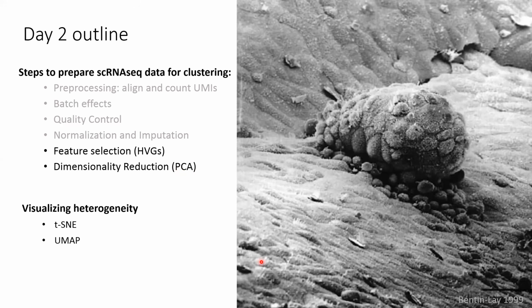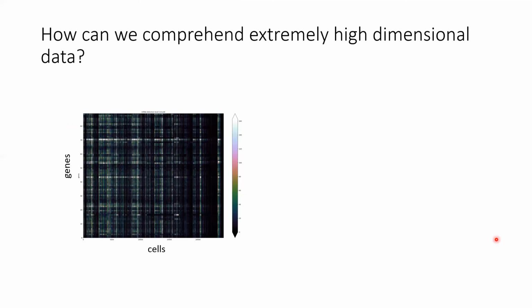And finally, we'll do another demo in ScanPy where we will quickly recap the quality control steps and then apply our dimensionality reduction tools and then do some more open-ended exercises where you can try to implement some of ScanPy's functions on your own. Okay, so let's get into it.